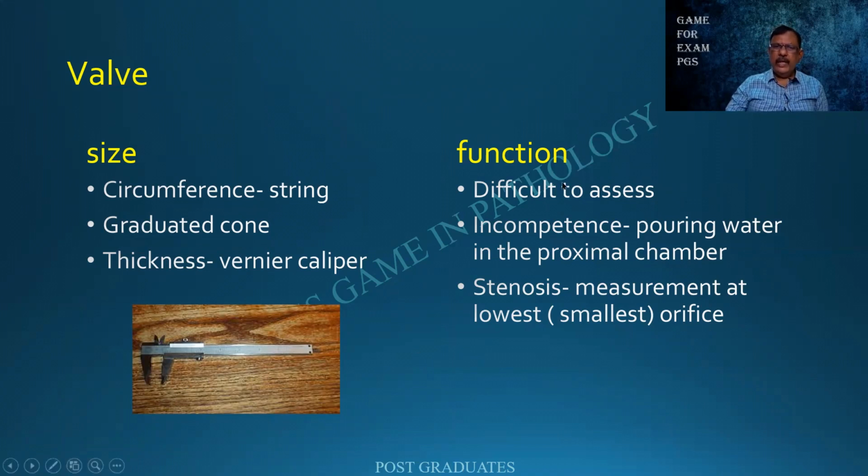Coming to the function of the heart, it is somewhat difficult to assess at autopsy because the patient is no more. Now I cannot say that this is the reason, but still Ludwig goes forward and says, if there is going to be an incompetence, this can be diagnosed by pouring water. If it is incompetent, it will go into the next chamber. And stenosis means there will be a smallest area that has to be measured, which is the stenosis.